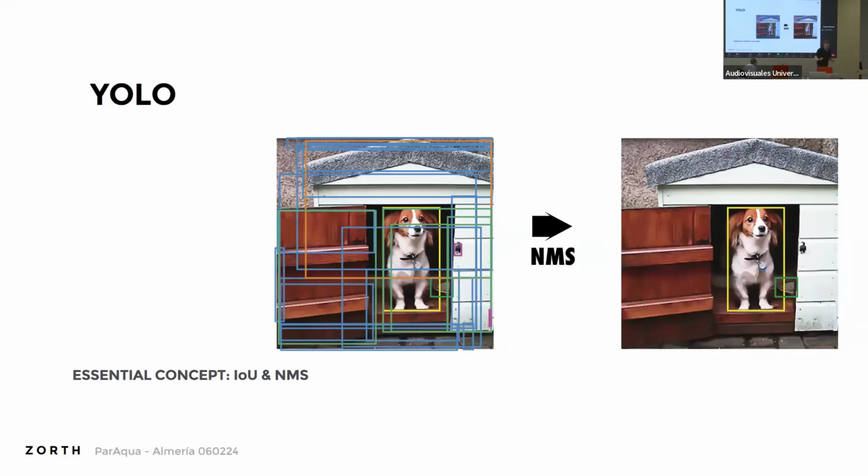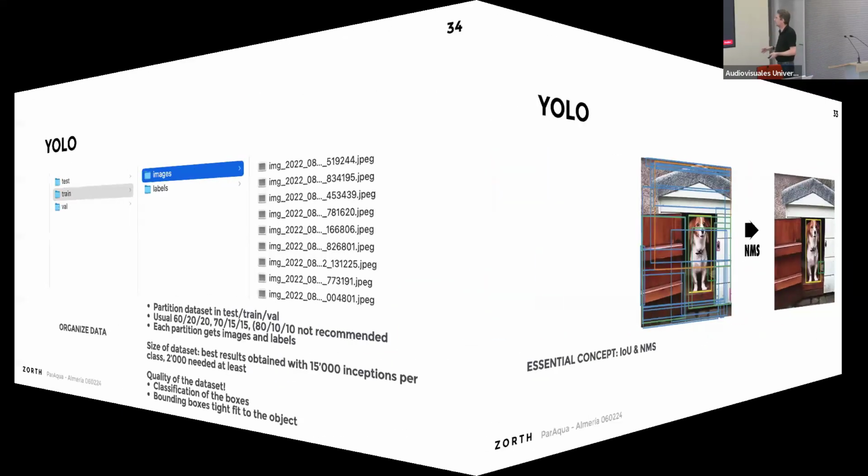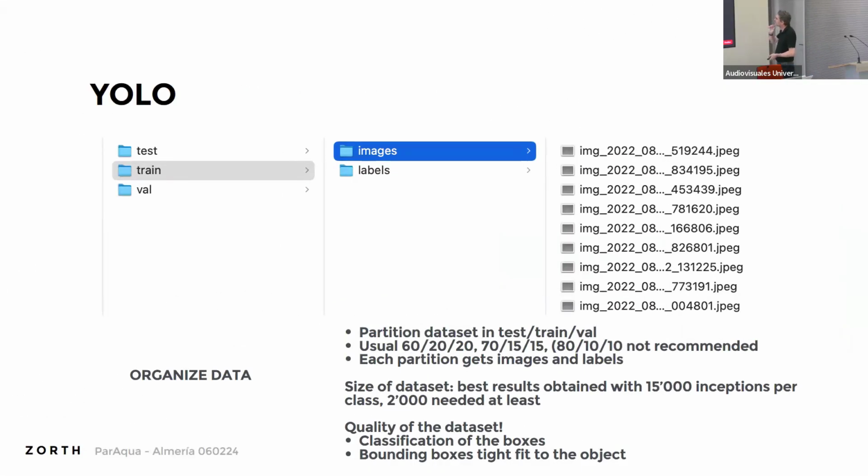The NMS is another parameter, and those are the two that you're balancing. So typically an IOU, you don't want anything less than 0.6. An NMS, you don't want anything less than 0.4. And you should be okay with that, with most of that.